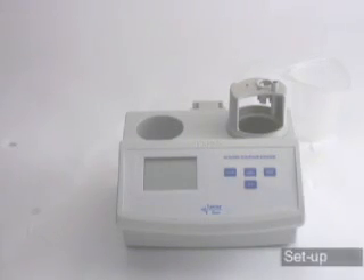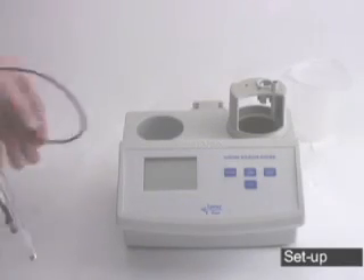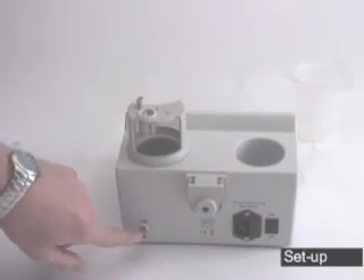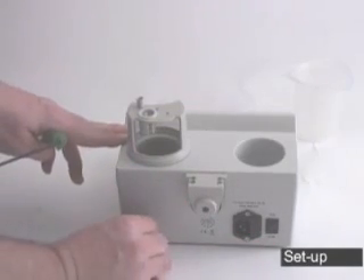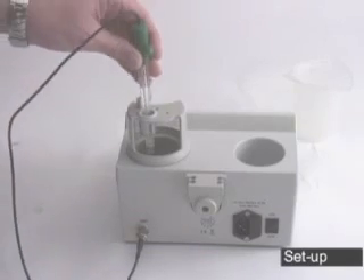Once you have the meter unpacked, the first thing we're going to do is hook up the probes and the tubing. Take your probe and remove the cap. On the back of the unit, we're going to have the probe hook up right here — the ORP probe — power here, and the on-off switch. Take the BNC connector, place it over with a half turn to lock it into place, and put it in the ring provided on the cap.